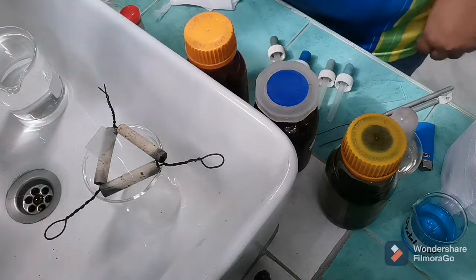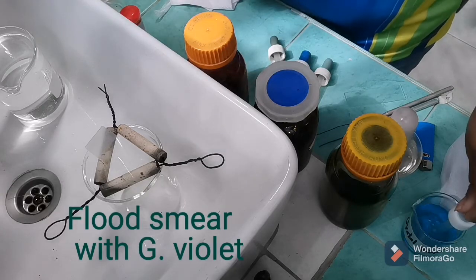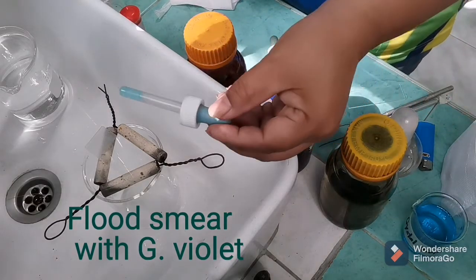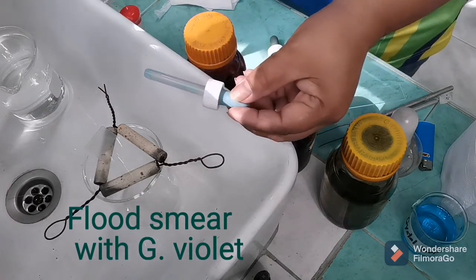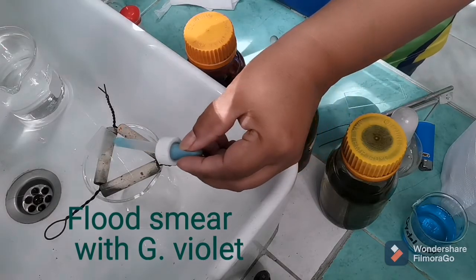Now we are ready to put some stain. The first stain that I will be using is the crystal violet. Exposure of this is only 1 minute. After 1 minute, I will be washing this smear with distilled water.